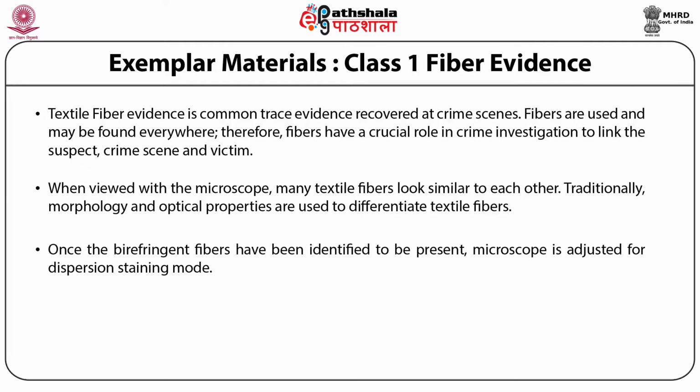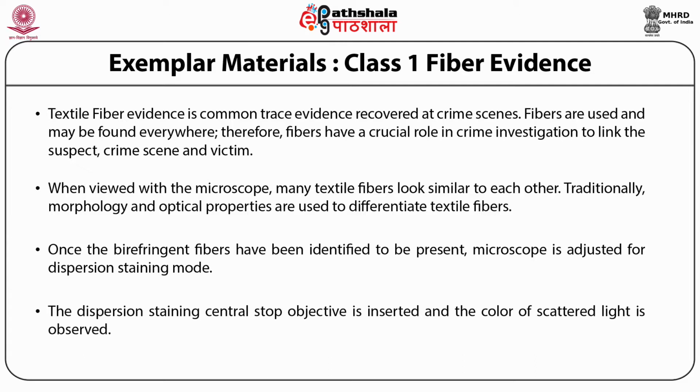Once the birefringent fibers have been identified to be present, the microscope is adjusted for dispersion staining mode. The dispersion staining central stop objective is inserted and the color of scattered light is observed.